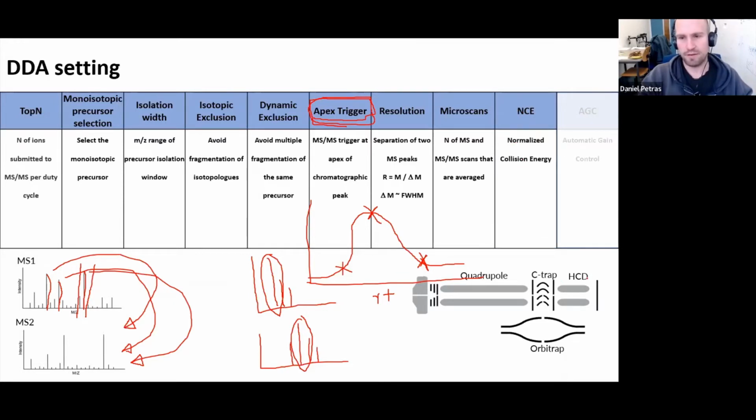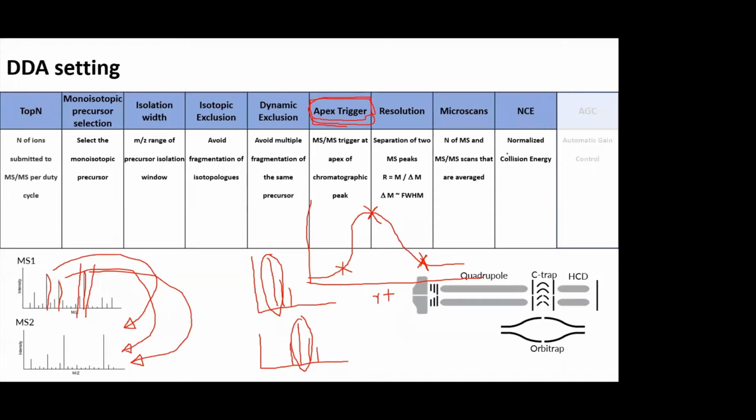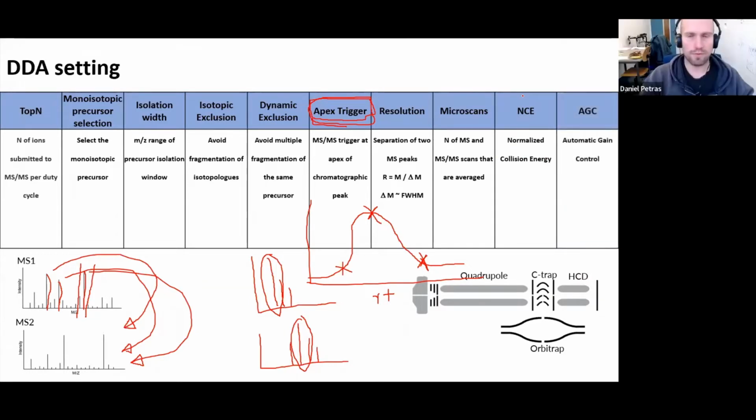So this is basically a value in percentage of the energy we apply to activate the molecules in our collision cell here to basically fragment them for MSMS. And then another thing that is very typical for ion trap based instruments, so both LTQs or Orbitraps, but not for TOFs, for example. So you won't find that there, is the automated gain control.